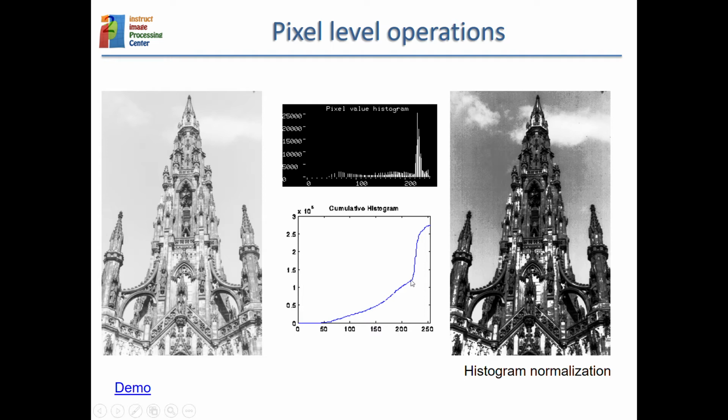But now, because the cumulative histogram has a lot of slope in this point, 218 will be mapped to, let's say, 218, but now 220 will be mapped to 230. So now the difference between these two neighboring pixels is amplified. So now the distance between the outcome pixels is much bigger, and then the output image has more contrast. So let's see this effect.